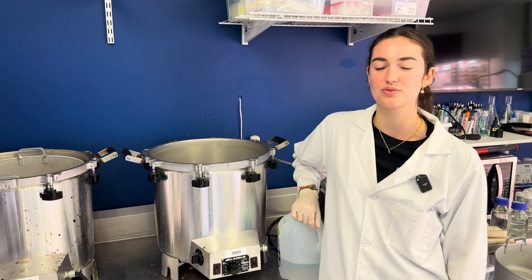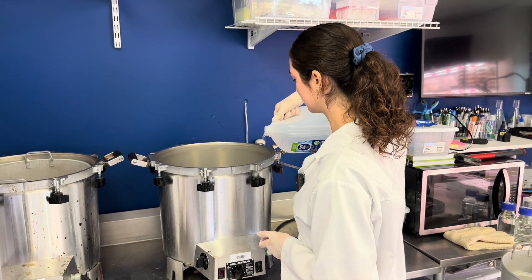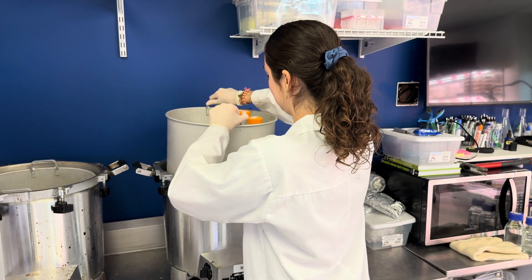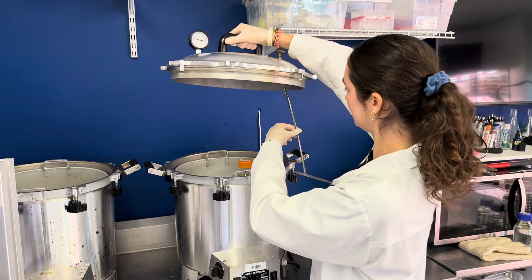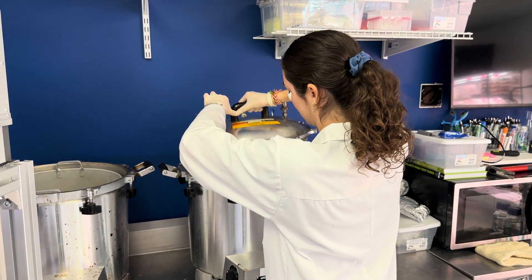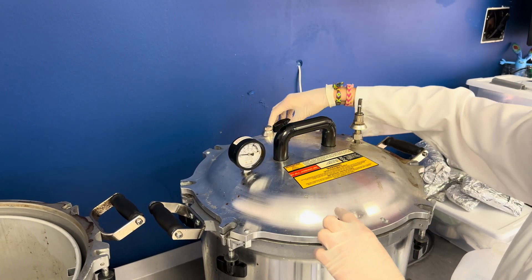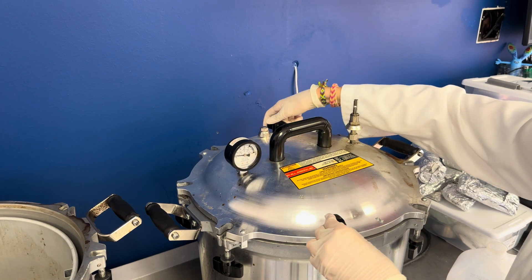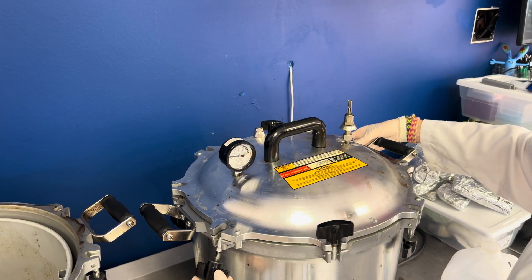Now it is time to sterilize our media, so I'll add distilled water into our pressure cooker, and then screw on the lid. Now that the lid is on, make sure to evenly tighten it on all sides. Remember, every pressure cooker is different, so make sure to read the instructions on your manual.